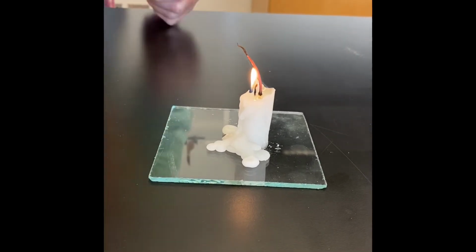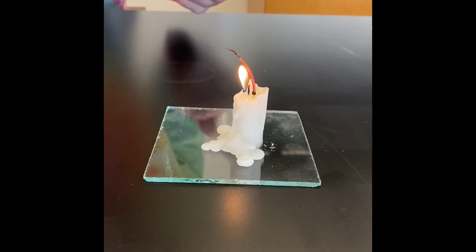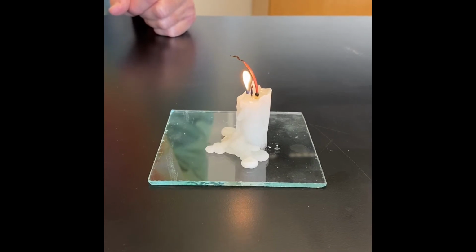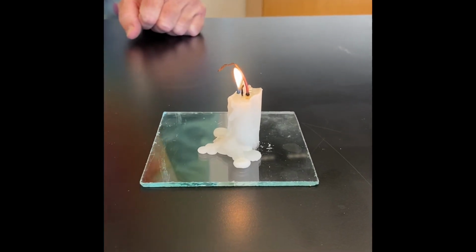Now we see the toothpick has relit the candle wick, but the toothpick itself is not maintaining a flame. So a toothpick probably isn't a good thing to use as a wick.